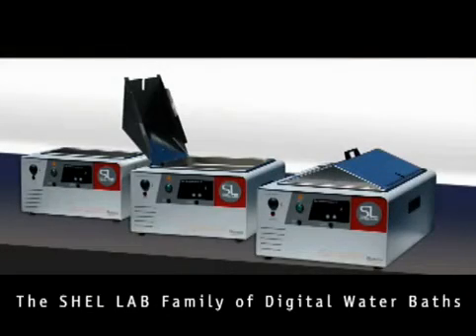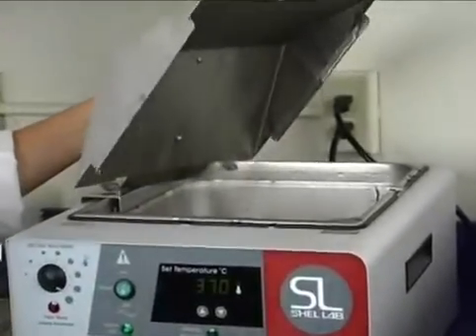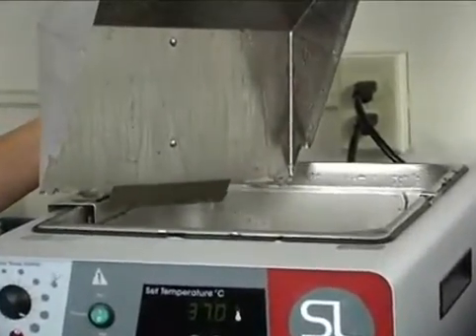The Shell Lab family of digital water baths has been engineered using decades of feedback from our customers. Our baths include a stainless steel lid designed to force water droplets from condensation back into the bath.